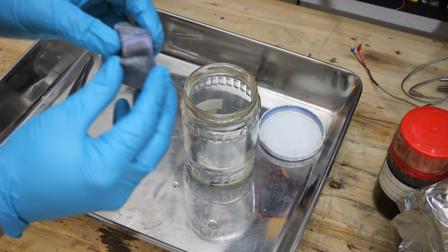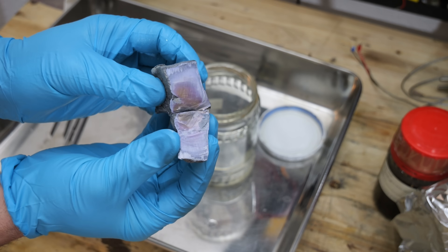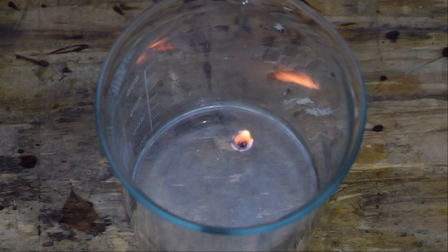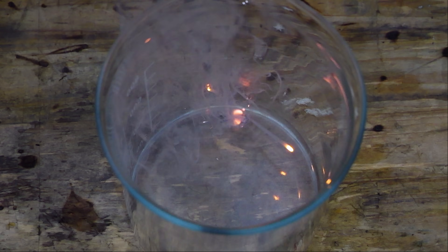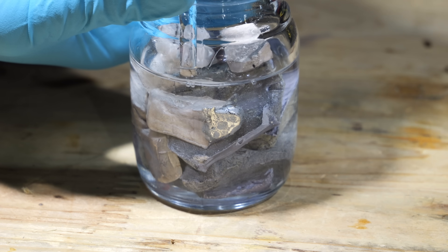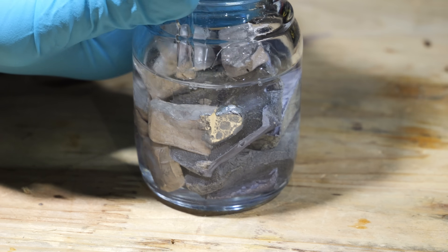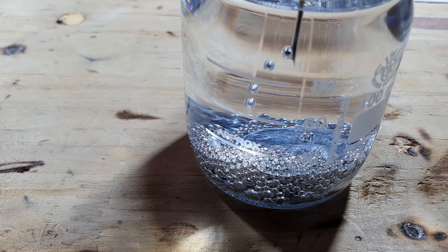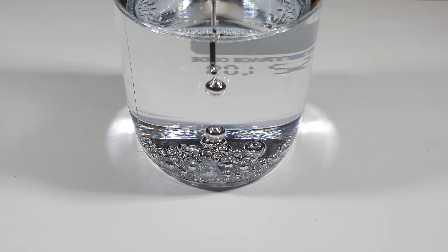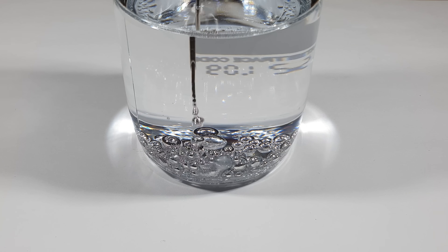Both metals are highly reactive — they ignite upon contact with water and can even explode. Here you can see how a small piece of potassium reacts when I toss it into water. But the real magic happens when these metals come into contact with each other. Individually they are solids, but when mixed they become a liquid. Here you can see the silvery drops of this liquid metal. It's what's known as a eutectic mixture, having a lower melting point than either metal alone.